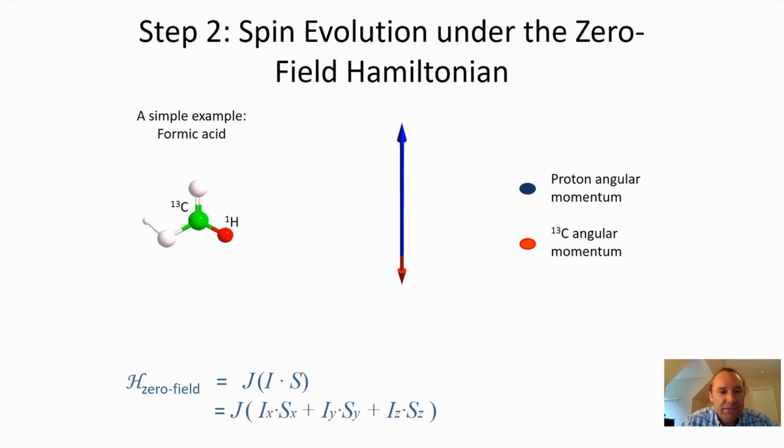Good. Okay, so now we've applied our pulse. We've maximized our IZ minus SZ. And so the next thing is spin evolution and the thing that we detect. So what does spin evolution look like? You've prepared the state, and now you let this evolve. And this is the funny thing that happens, and this is what we're going to talk about a lot now. We're going to talk about why this IZ minus SZ starts interchanging. And obviously, if this is what happens, this modulates the magnetic field.